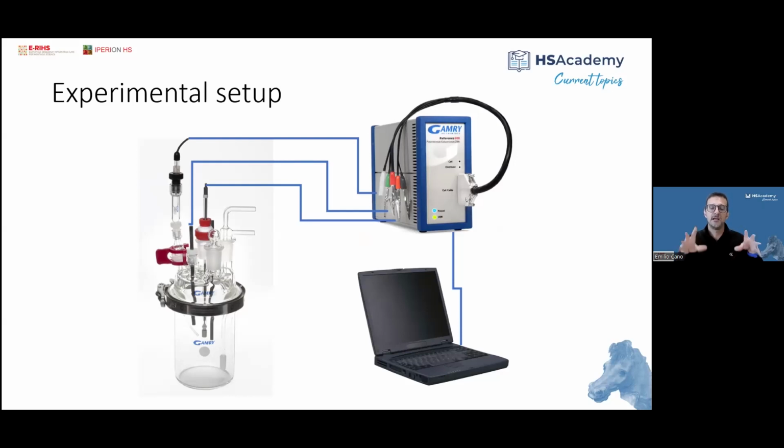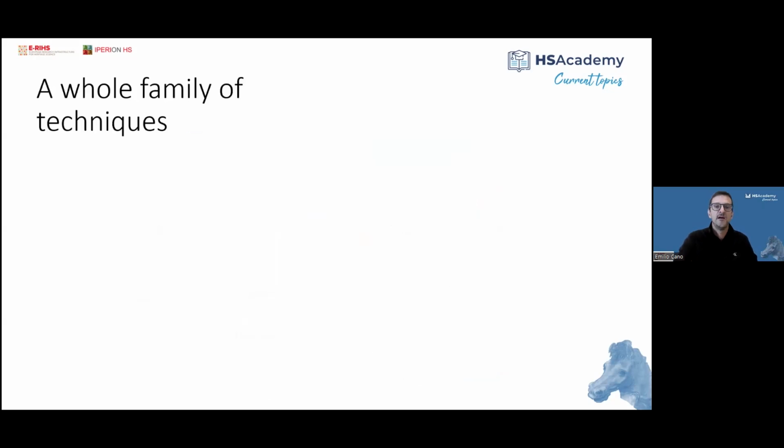We put that within an electrolyte, which we can choose depending on what we want to measure. And we connect that to a potentiostat. It is this device. This is one example of a small one that we use for field measurements, and that is controlled by a computer. So you see, it is not something large or expensive.